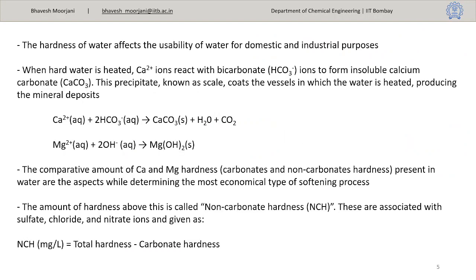Now, why is hardness important? From a household point of view, as we discussed, because of hard water the soap performance is reduced. The fatty acids of soap become insoluble and the functionality of soap will go down. Okay, so that is one, the domestic purpose.